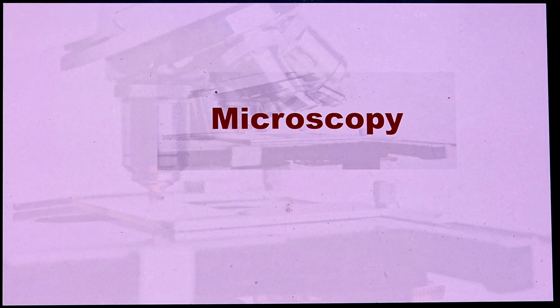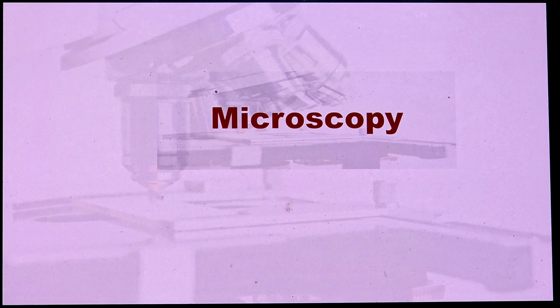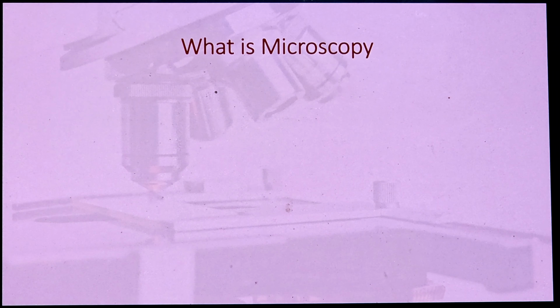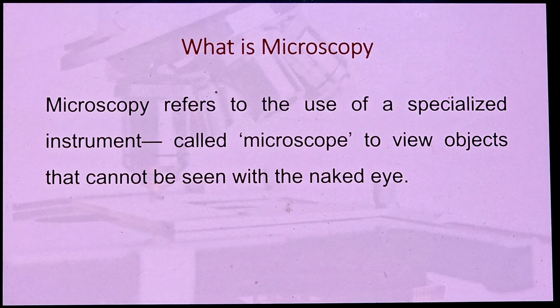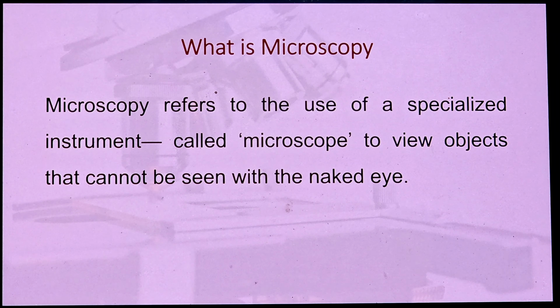Today we will begin with the most essential chapter in every microbiology laboratory, that is microscopy. So what is microscopy? Microscopy refers to the technique in which a specialized instrument called a microscope is used for the visualization of objects that cannot be seen with the naked eyes.